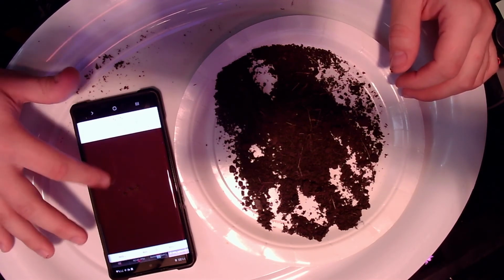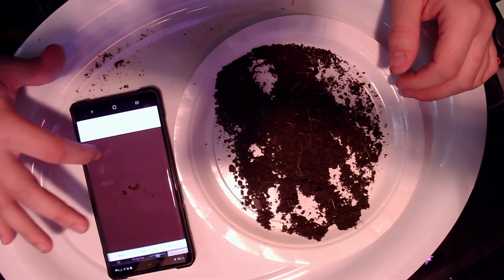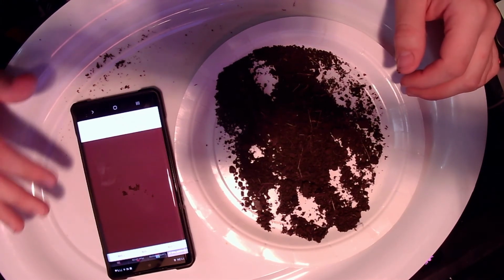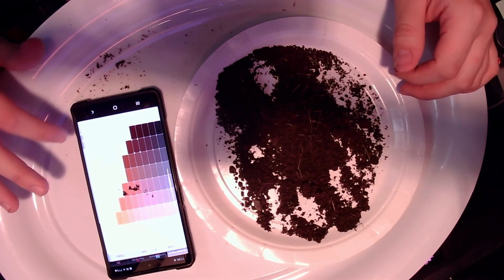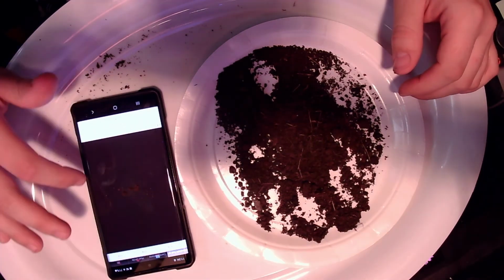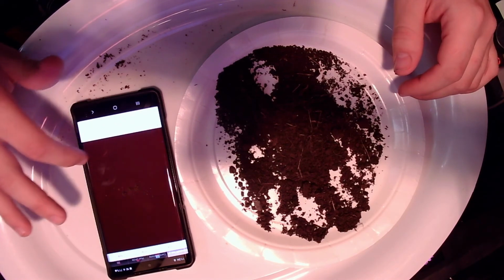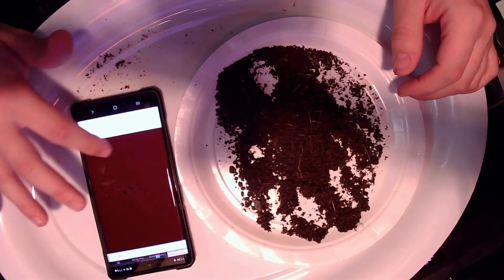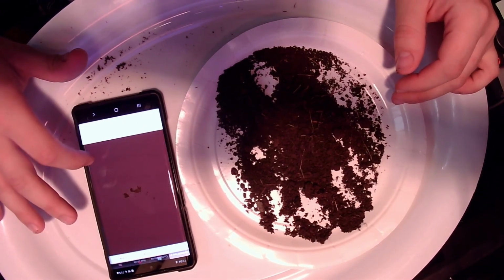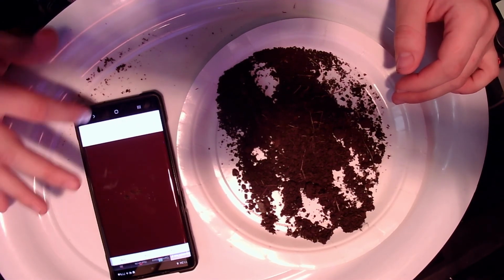So now we go 1. I think that's too dark. And then going, we can't go down because we're already at 1. So 2, yeah. Value 2, too bright. So we're going to be into the 1s for value for this soil. So that's too dark. Yeah, that's pretty close. 1/3, 1/4 is definitely too much red. So let's go down. 1/3 is probably close.